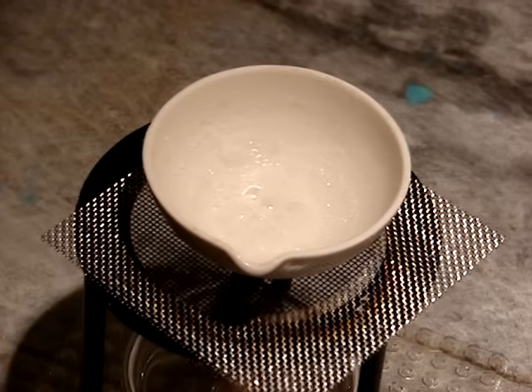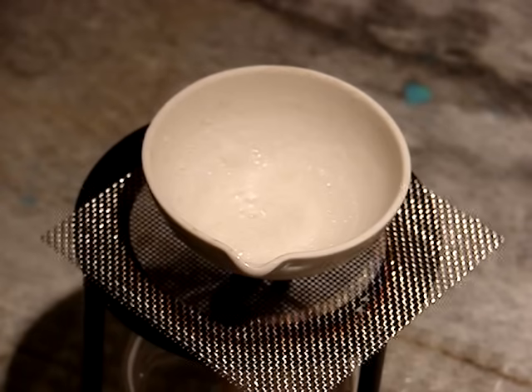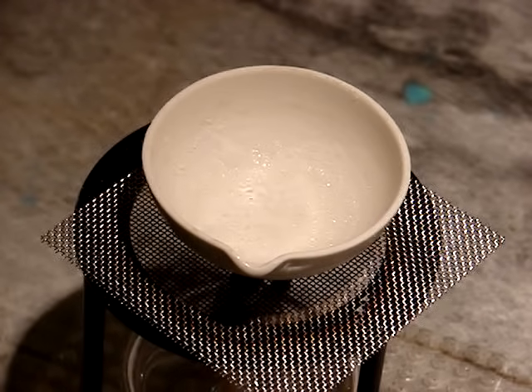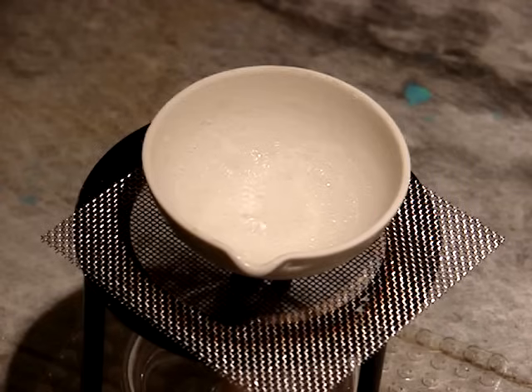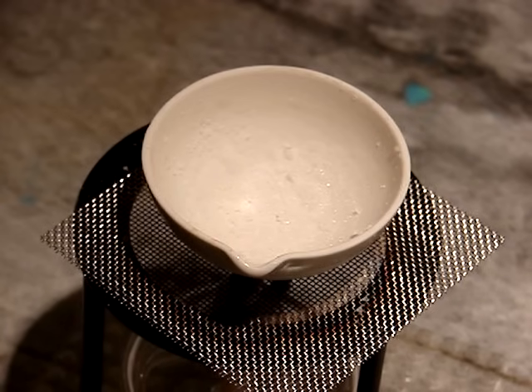Okay, so here's the epic end to our water evaporating awesomeness. You can see, hopefully, the water is bubbling and the water is getting out of all the salt, and there's going to be no more water in it, and just salt. We have to wait for all the water to get out, otherwise it's sort of half liquid salt. It's going to crackle and pop just like popcorn, because all the water is evaporating very quickly. It looks just like popcorn.